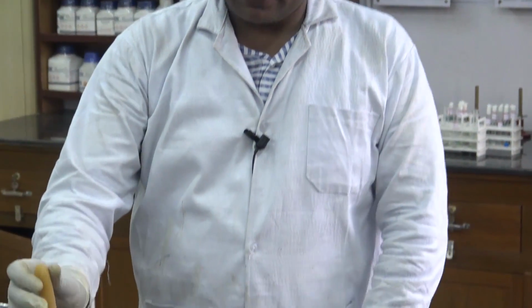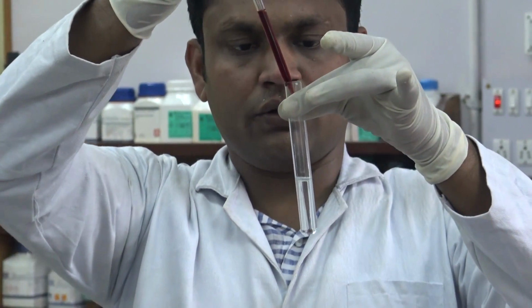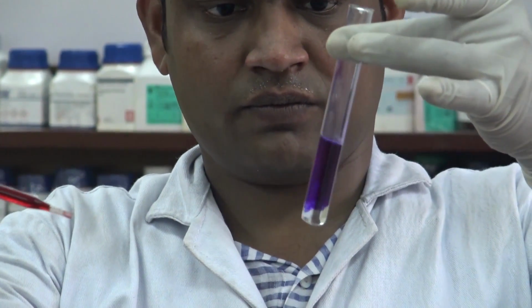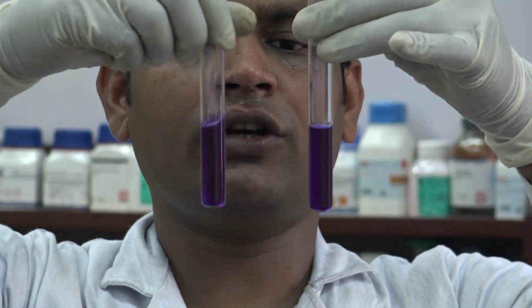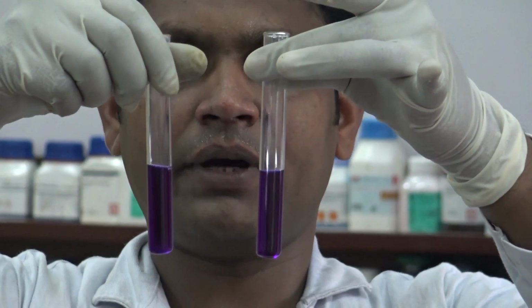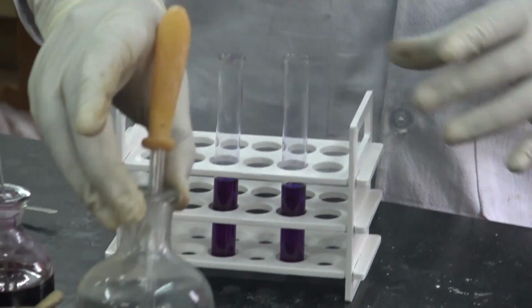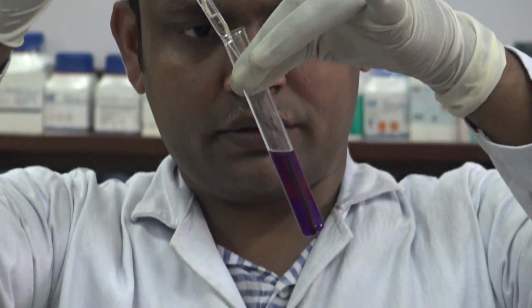Now add few drops of Aluminon's solution into the solution. Here you can see that both colors are the same, that is violet. That color appears for the Aluminon's reagent. Now after adding the Aluminon's reagent, we will add acetic acid solution until the color disappears.